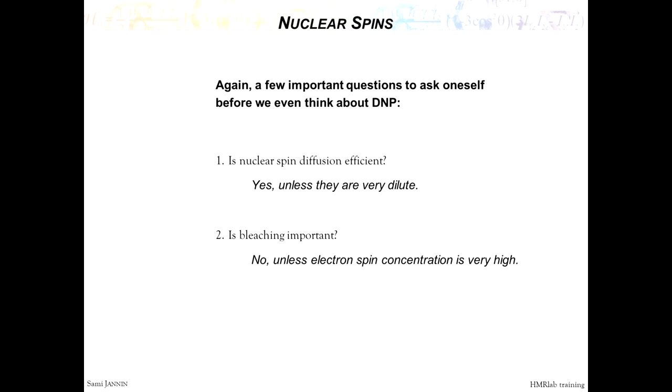I think it's hard enough to have the simulation that fits the data. But then once you fit the data, you can play with the parameters, and that's what we're going to try to do tomorrow, to look at the equation and see how the parameters affect the efficiency of the DNP. But I've not seen any papers where they can really quantitatively simulate and find the value.